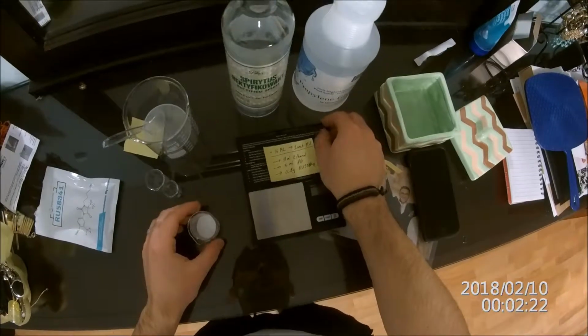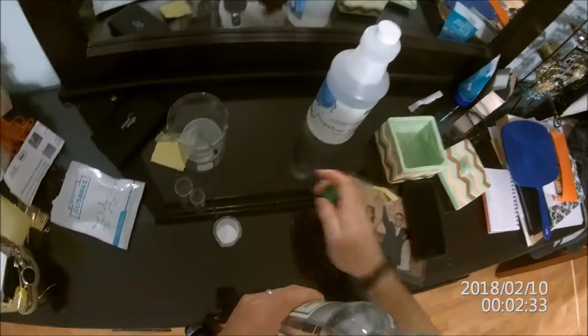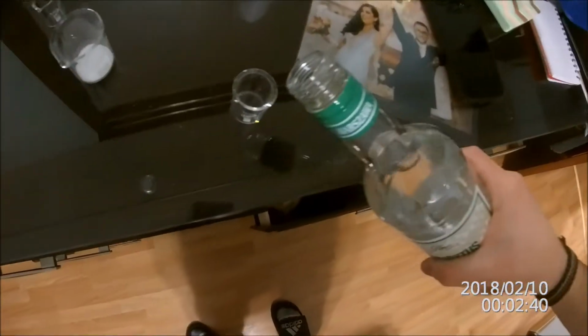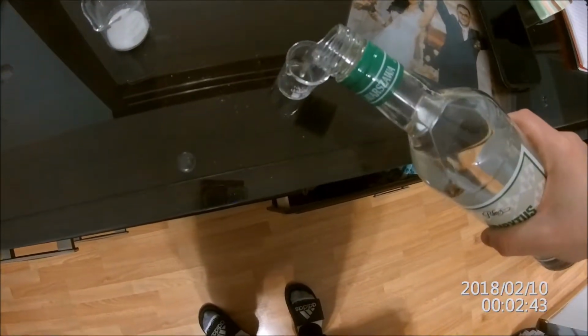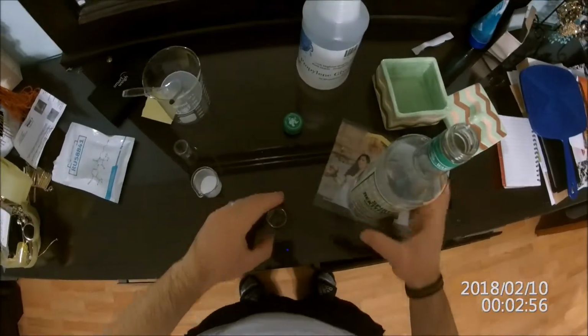We don't need the scale anymore. We're done with the scale. What we need is to measure, like we said, 11 milliliters of this. So I have this beaker, which measures 10 milliliters. So I'm going to fill this beaker with 10 milliliters. And that is exactly 10 milliliters. You guys probably can't see it, but I can, and I see that it's exactly 10 milliliters. It's a pretty good job, actually. Well, it needs a little bit more.